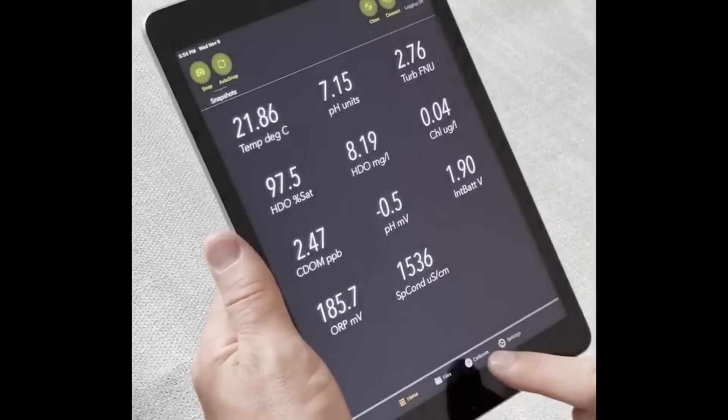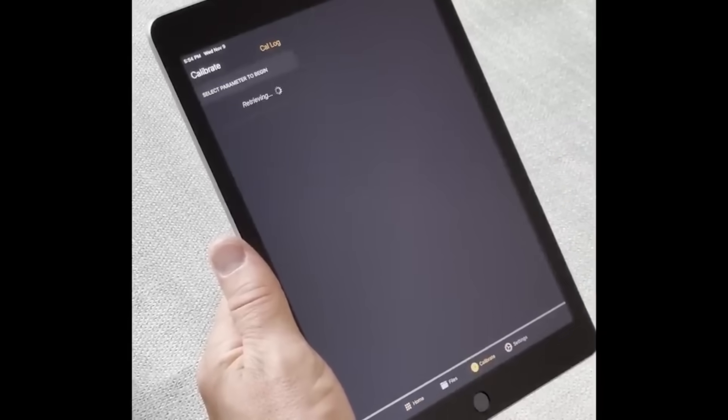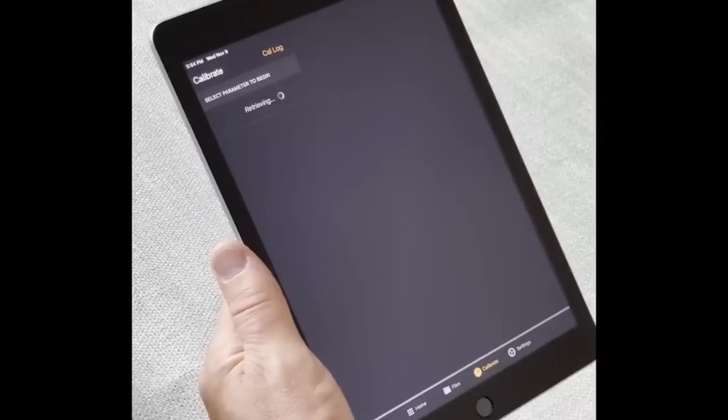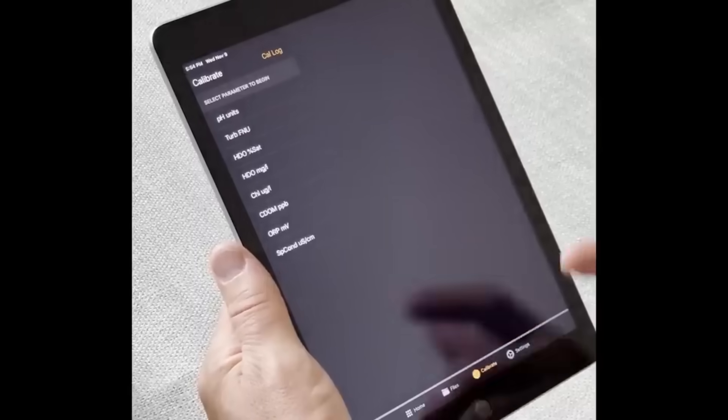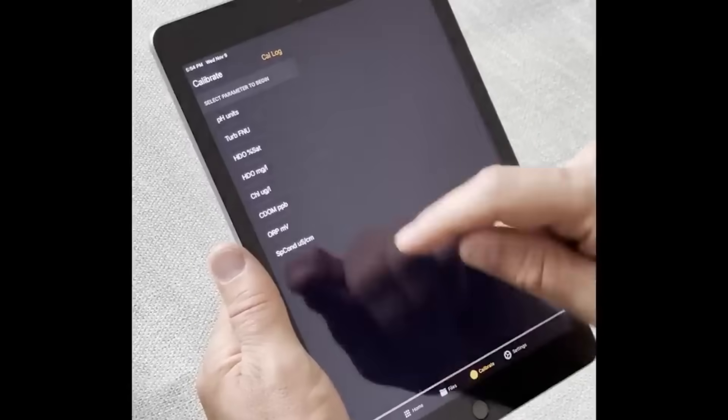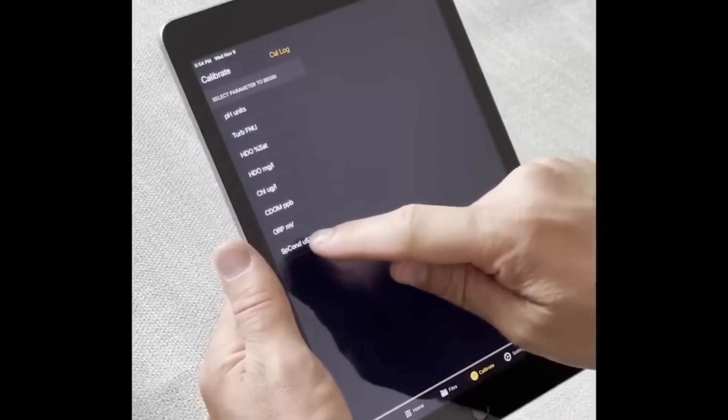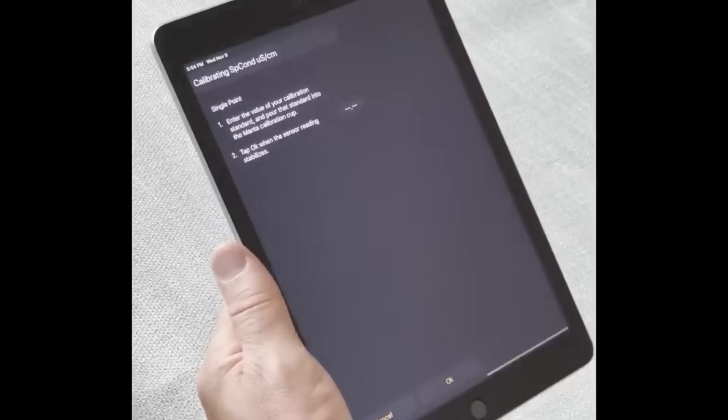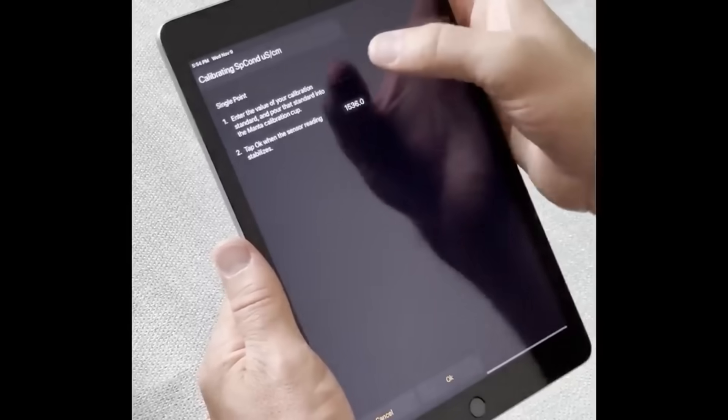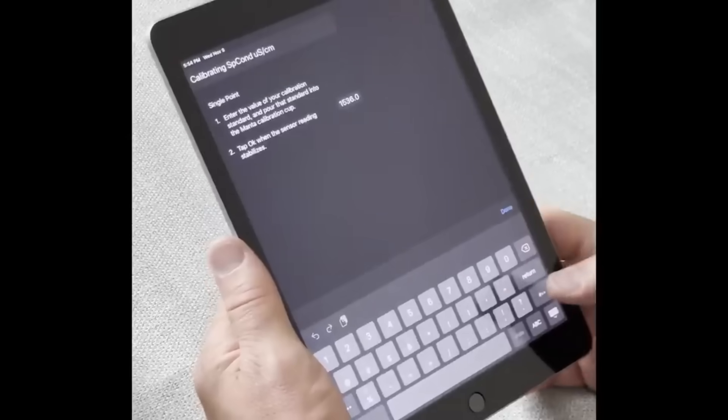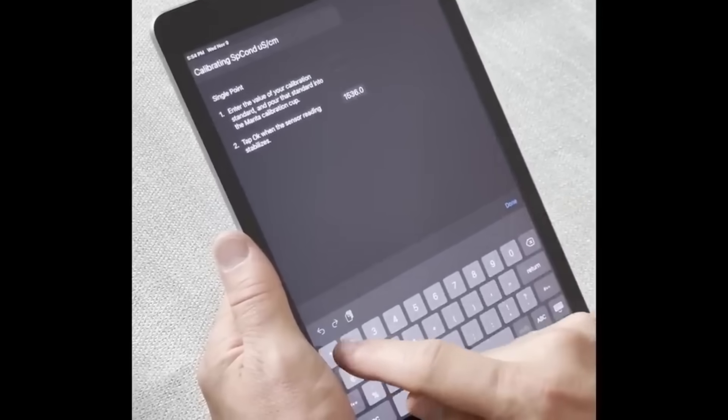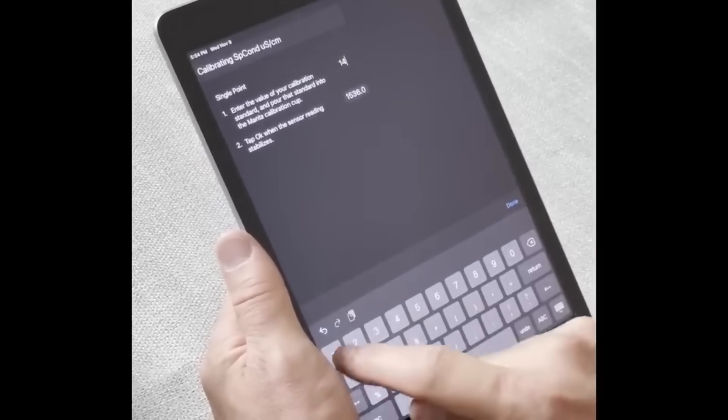Tap calibrate at the bottom to see a list of calibratable parameters. We're going to select specific conductivity. Tap the text box to type the value of your solution. This is 1413.